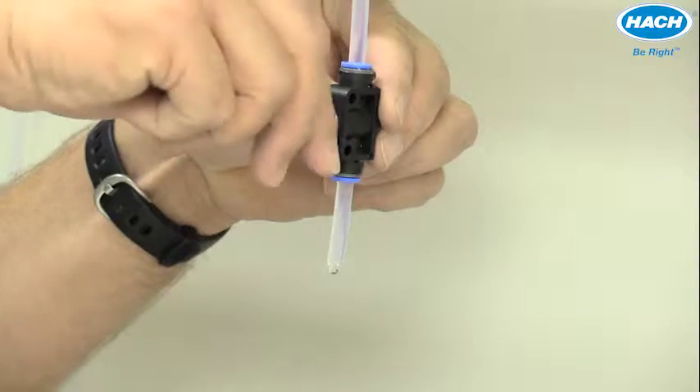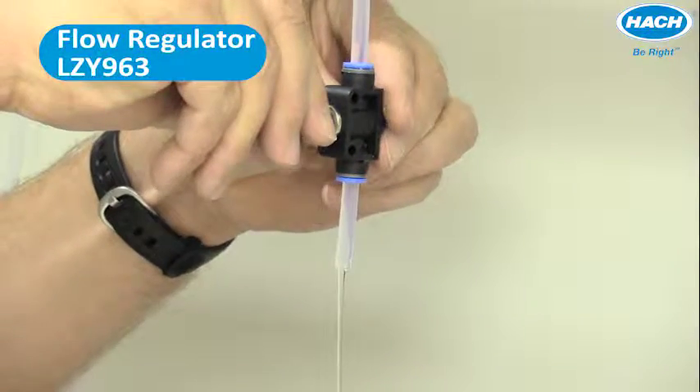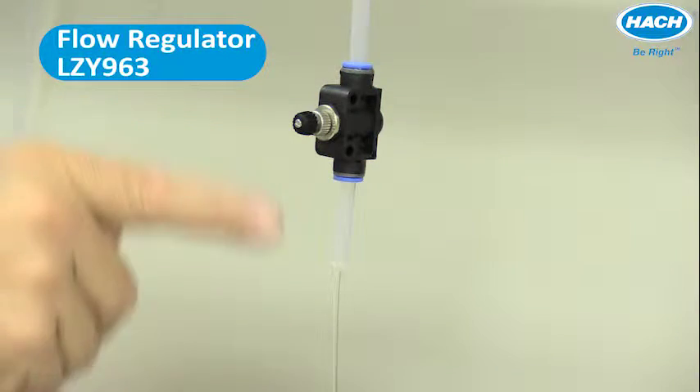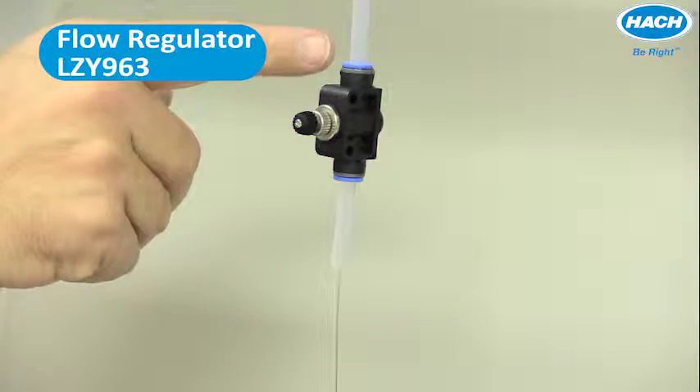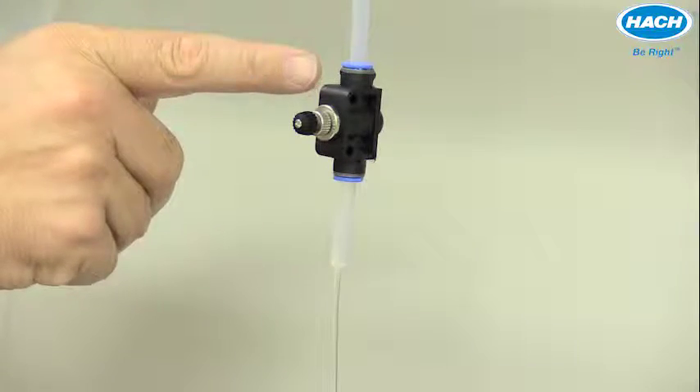The included flow regulator can be installed on the drain line of the process turbidimeter to control flow rate and also to create necessary back pressure in some samples to prevent air bubbles.